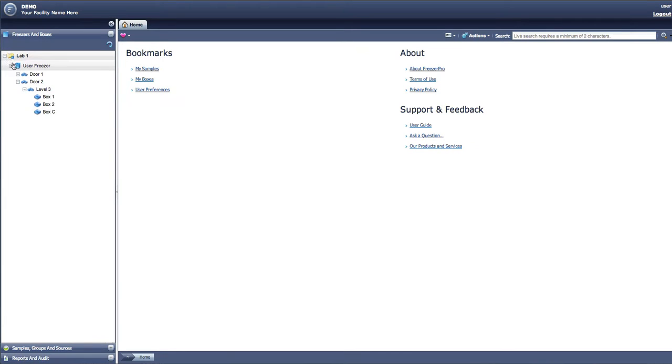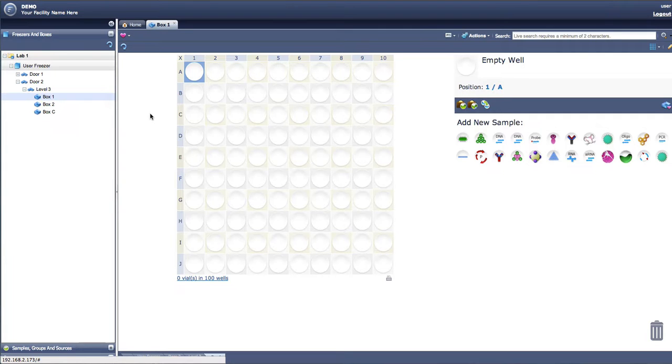There are many actions that can be performed when working with samples. Creating samples, deleting samples, and editing samples, as well as changing sample volumes, copying and pasting samples, removing samples from freezers and restoring samples to freezers, setting sample alerts, printing barcodes for samples, adding samples to pick lists, pasting copies of samples as new samples, creating derivatives, and cutting and pasting samples to new wells and locations.